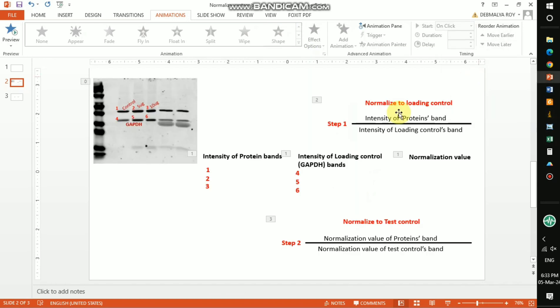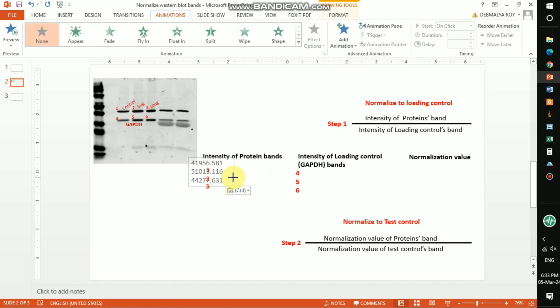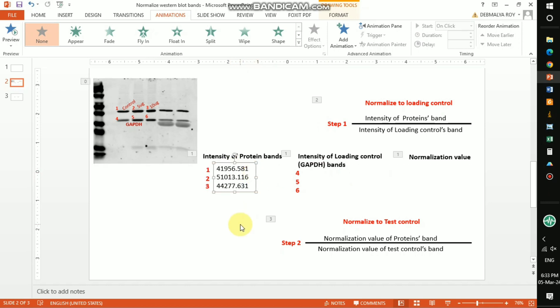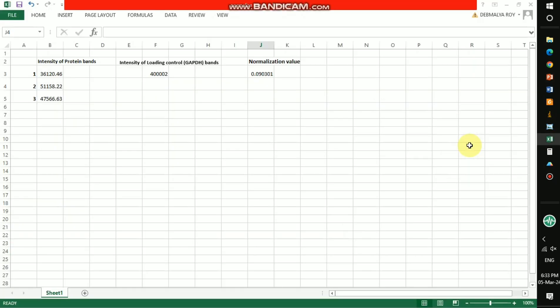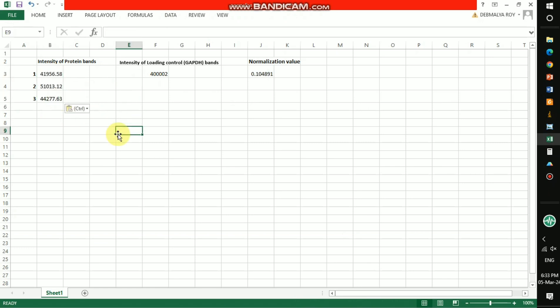I already got three different intensity values for the three protein bands. I'll copy these values and paste them into the table and also into the Excel file — these are the protein band intensities.